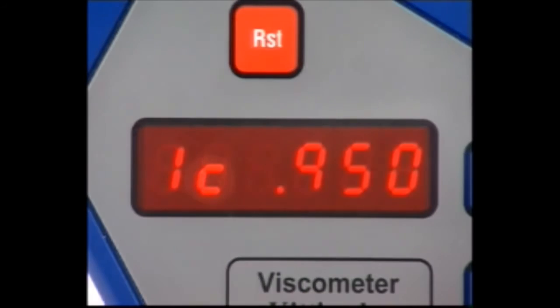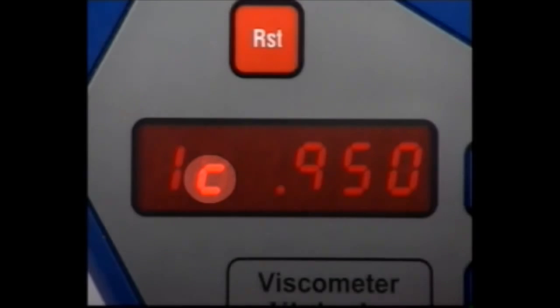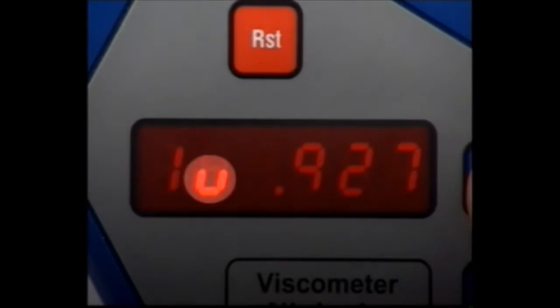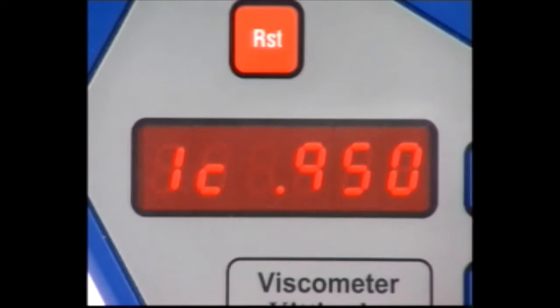Press Return to recalculate centistokes at 40 degrees Celsius. In Mode 1, the small c indicates a corrected reading at 15 degrees Celsius in vacuo. If you were given a reading at 50 degrees Celsius in air, correct this by pressing Return and entering your uncorrected reading. Press Return again to obtain the corrected readout at 15 degrees in vacuo. This value will then be used by the viscometer for all the other calculations.